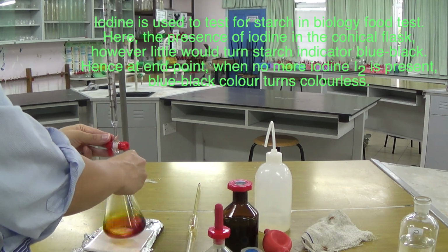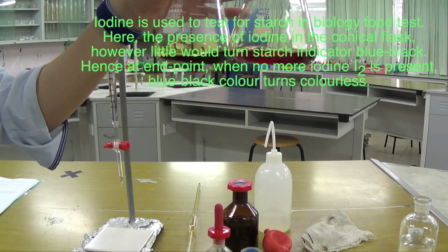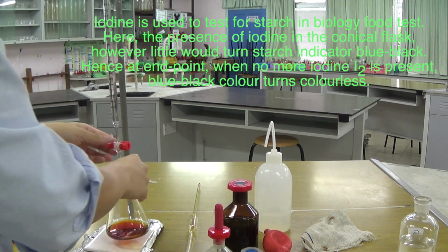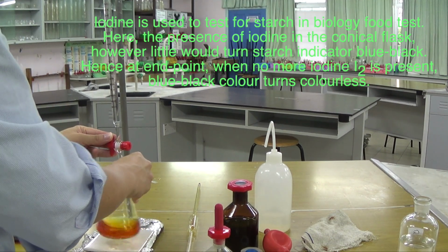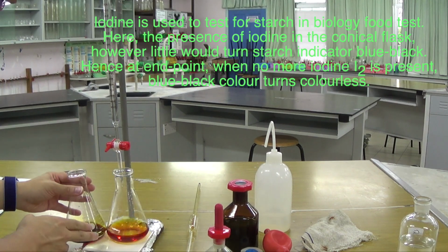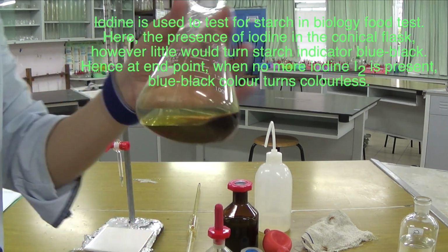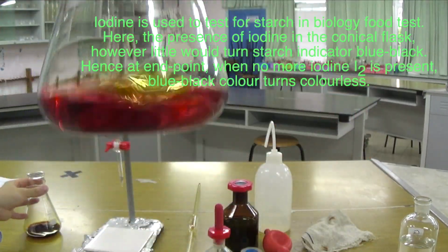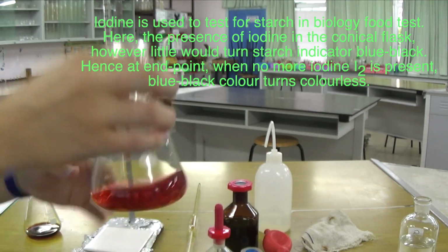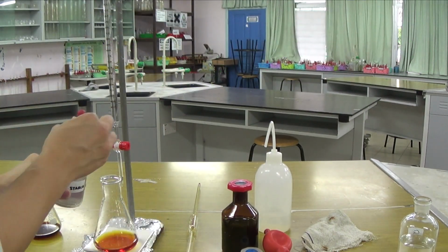So it's getting a bit lighter now. As you can see, it's not as brown as it was. Well, actually, it's still pretty brown. So let's add a bit more. So this was the original solution, a lot darker. This is just the iodine on its own. This is the one where I've added a bit of thiosulfate already, so some of the iodine has gone to iodide. I would say this is about the region that I would add in the starch.